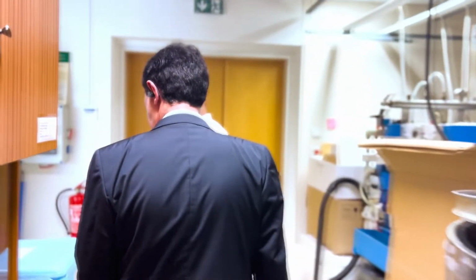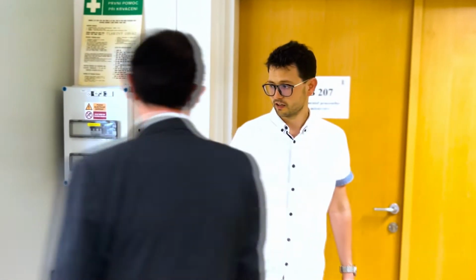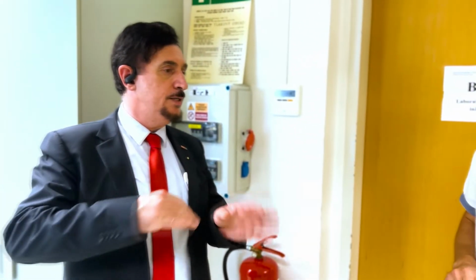So this is the casing, the sausage casing. Yes. Then we go to another department, the lab. We have other laboratories, because part of the research as well as part of the production is the detailed analysis of the products and intermediates. So you produce the fertilizer here. Yes. Different kinds of fertilizer because of different parameters, different conditions.